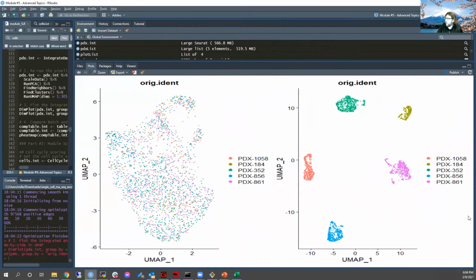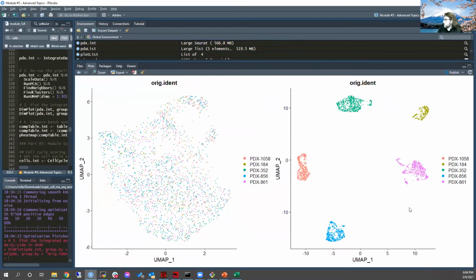So we can see here our original data with all the batches. And we can see now everything has been corrected together. It's all mixed together nicely. And yet the shape, this characteristic teacup shape, is preserved. So you have this interesting loop here, and then you've got this larger body. And that was here, here, here. And in fact, there's one here. It's just too faint to see.